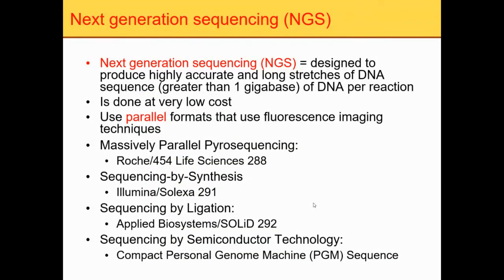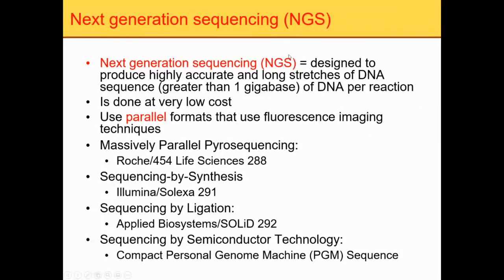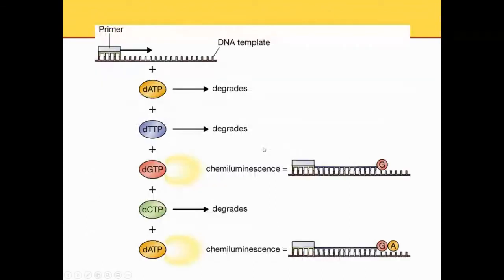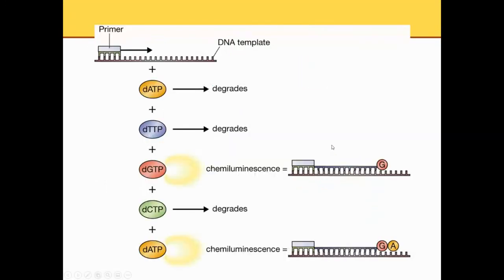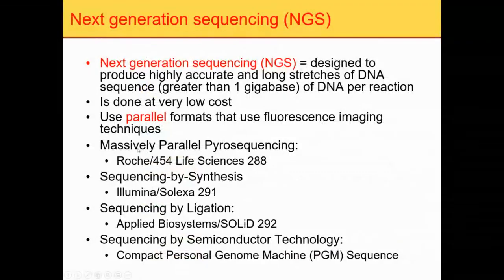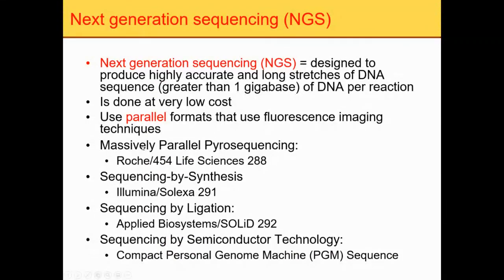And then in the past 10 years, the technology improved dramatically. The field developed next generation sequencing, or NGS. Basically, there are different types of NGS techniques. One can be massively parallel sequencing, which is an advanced technique from parallel sequencing, right? They can perform hundreds of parallel sequencing reactions at the same time in a well. That's why it's called massively parallel sequencing.